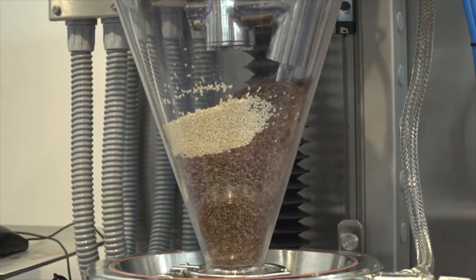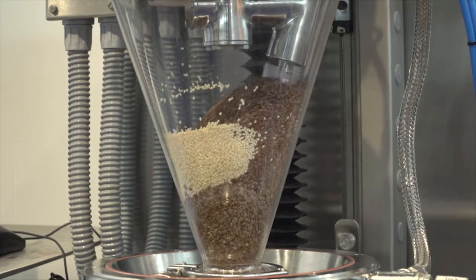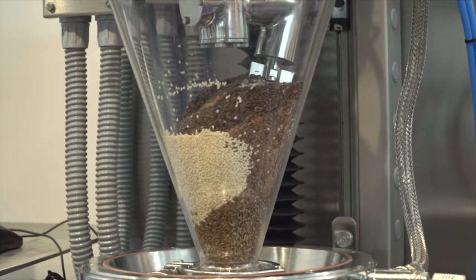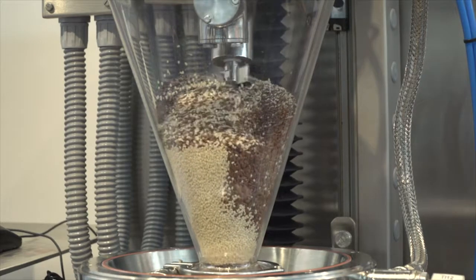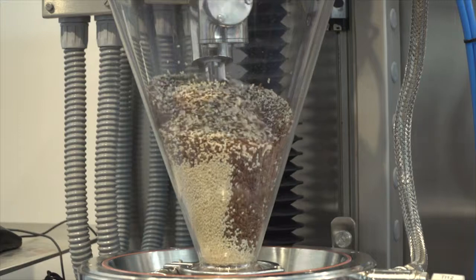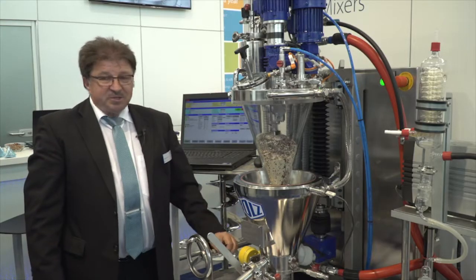And now you can see how gently the screw lifts the lower brown material to the top, where it already starts to get blended and homogenized in a very gentle and soft way. Within minutes you can see that you have uniformed and homogenized all the batch products. Thank you very much.